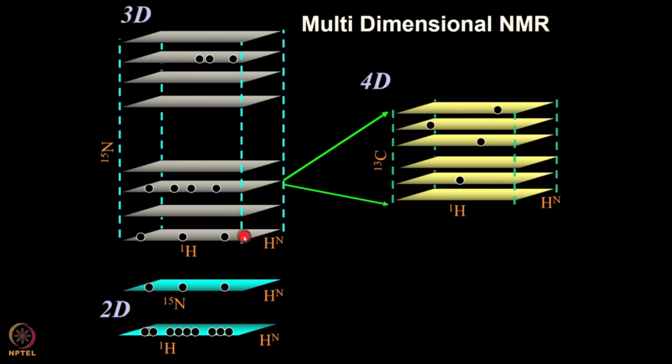So what do I get? I get here 3 peaks, which is easy to understand now. Well, this can be NH to the alpha, to the beta and to the gamma of a particular amino acid residue, and then another amino acid residue. This produces 4 peaks, which is certainly possible. You have from the NH proton to the alpha, beta, gamma and delta of that amino acid residue, and you have the third amino acid residue whose N15 chemical shift is here.